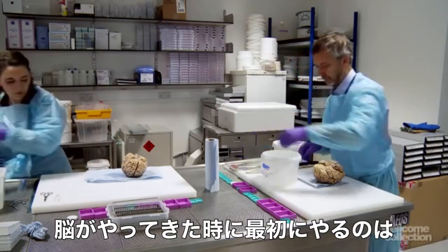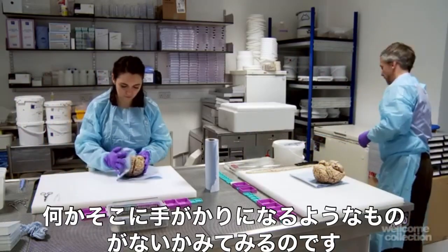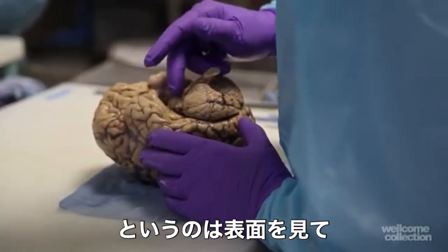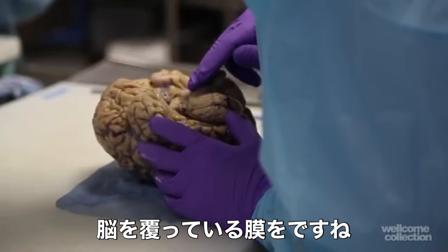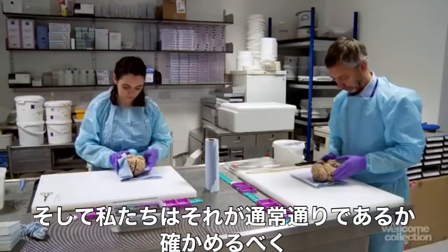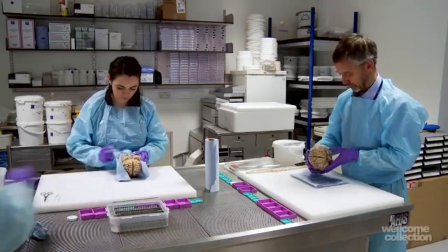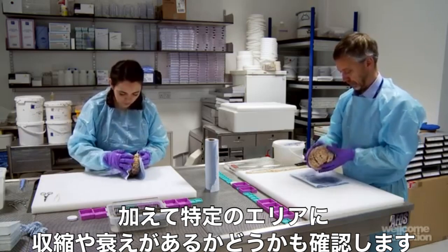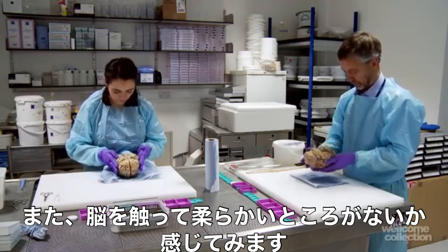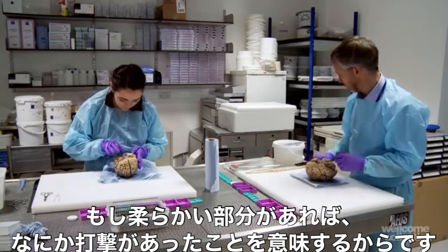The first thing you do when you get the brain is to examine the external features to see if there's any clue as to what might have gone on. So you look at the surface of the brain, the membranes that cover the brain — is there any evidence of any infection? We then look at the patterns on the surface, the folding, to see if that's normal and whether there's any shrinkage or atrophy in any particular areas. We also feel the brain to see if there's any softening, because if there is a soft area that may indicate there was a stroke in that area.